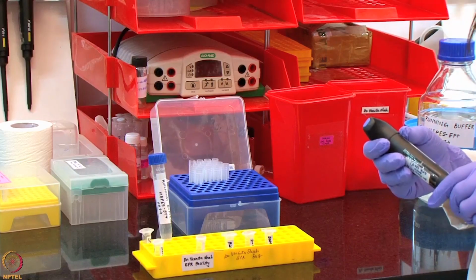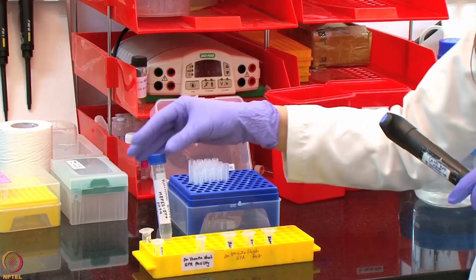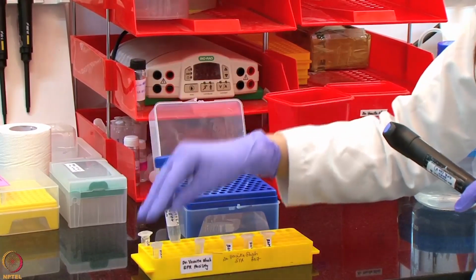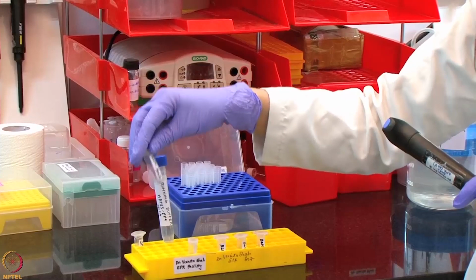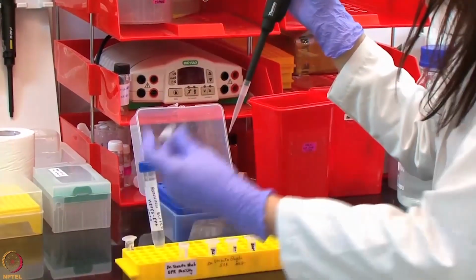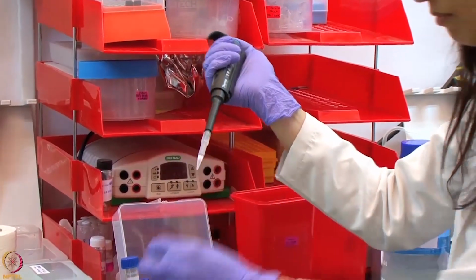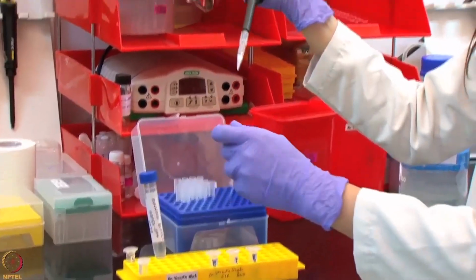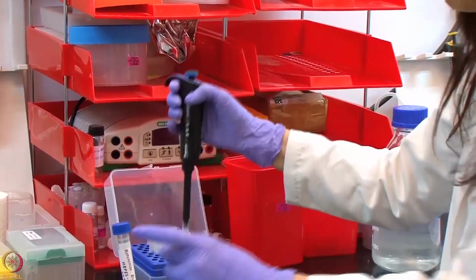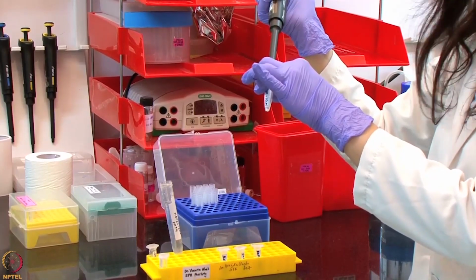We will be preparing this concentration series in 2-fold dilution using the running buffer starting from 32 nanomolar solution, which means we will add 300 microliter of 32 nanomolar concentration with 300 microliter of buffer to prepare 16 nanomolar concentration.